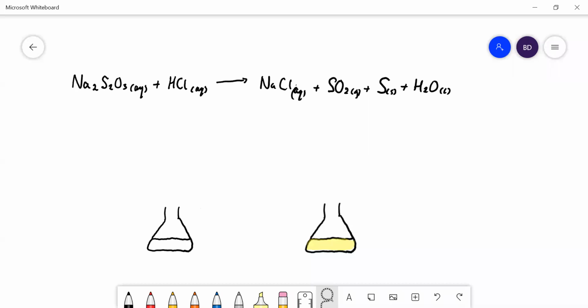This is the required practical on the AQA GCSE for rates of reaction. The reaction we're going to react here is sodium thiosulphate. And when you add acid to that, some hydrochloric acid, you get a solid produced, you get sulphur produced. Right, let's just balance that equation.